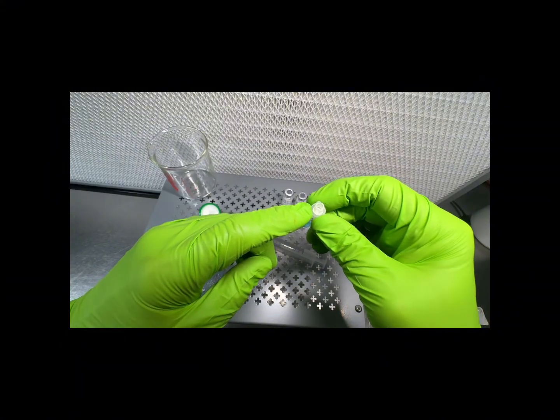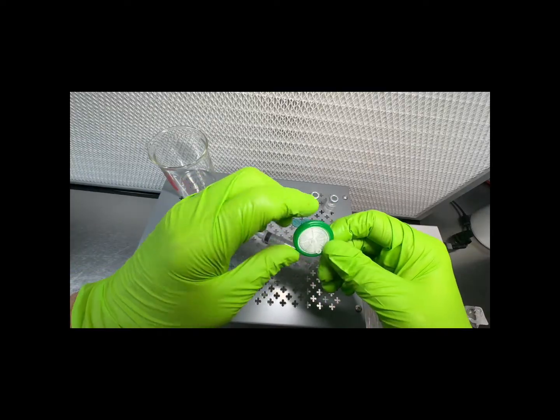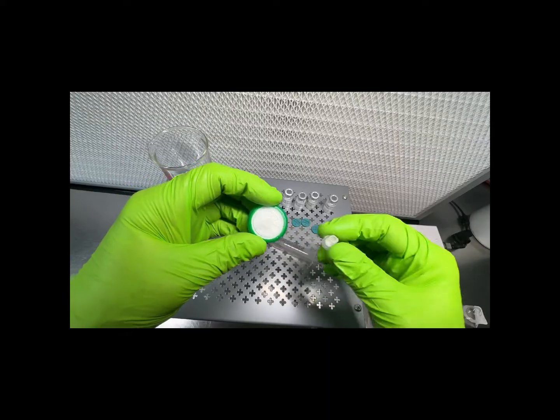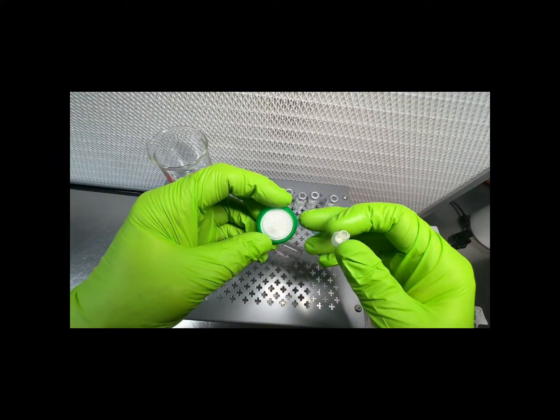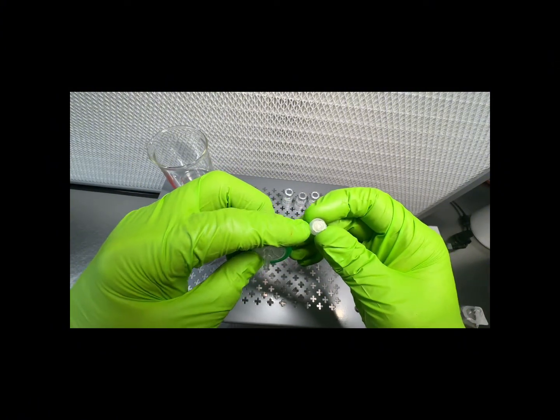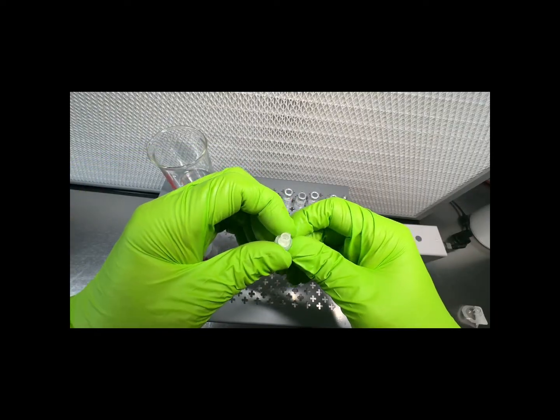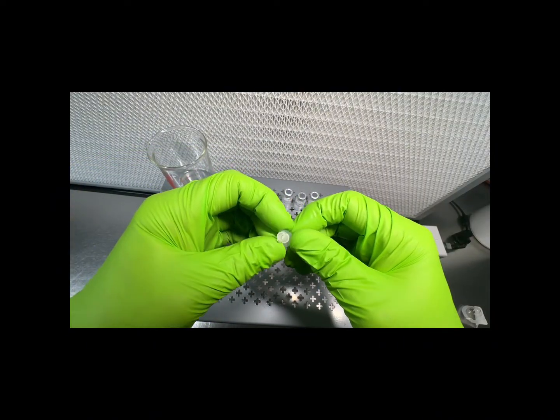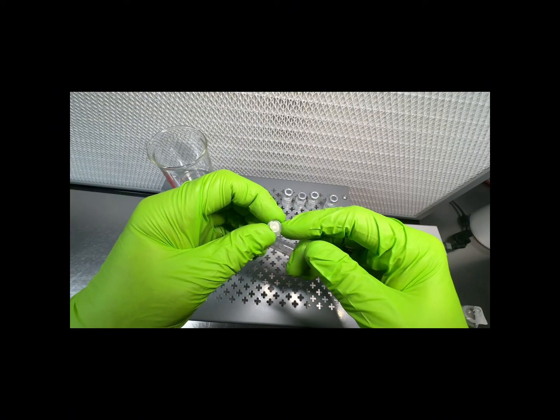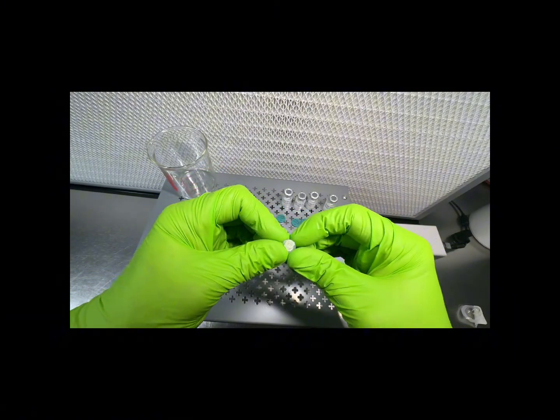Some other common sizes are 13 millimeter, 25 millimeter, and then 33 millimeter, which is this guy. And you can imagine that after filtering, you're going to have a lot more liquid with your peptide in it stuck inside of this housing instead of inside of this housing. In our internal test, which we'll be publishing soon, this, after filtering, holds about 0.07 milliliters inside of this housing afterwards.